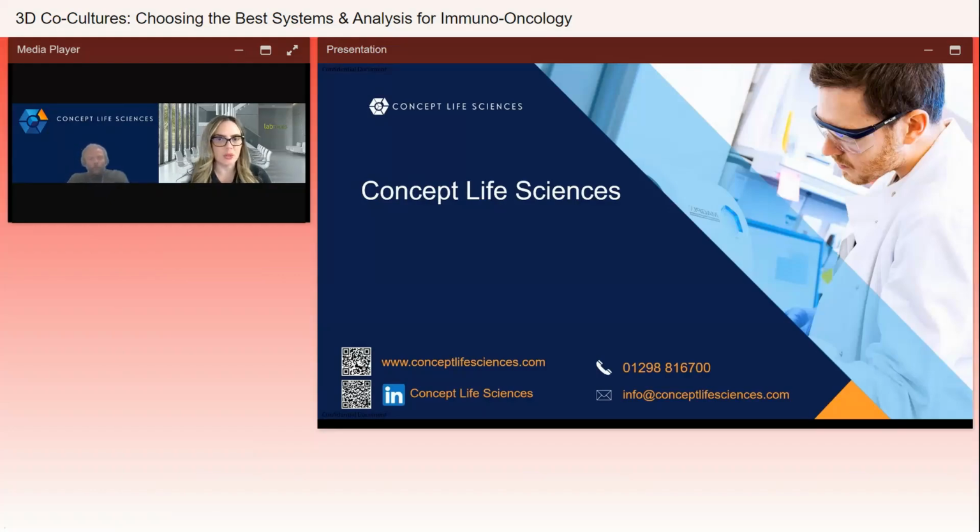Okay, great. We are getting a lot of really great questions in here. So it looks like we have time for a couple more here. This next one says, have you ever tried to incorporate T cells in spheroids instead of adding them on top?